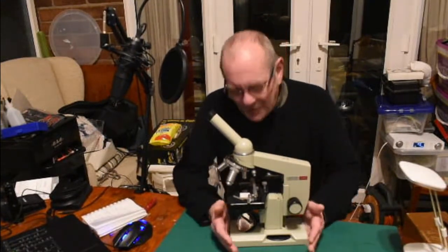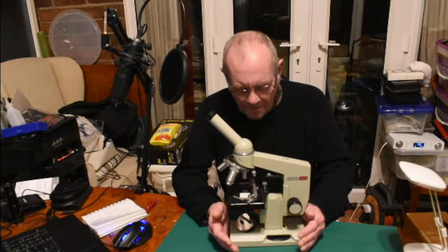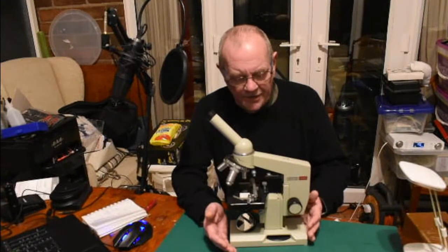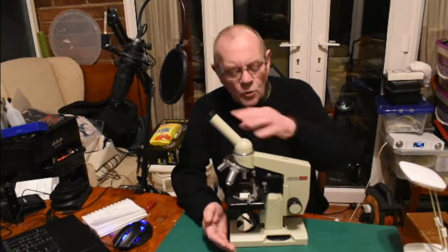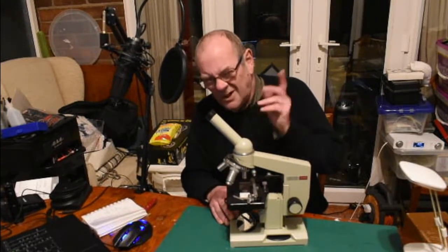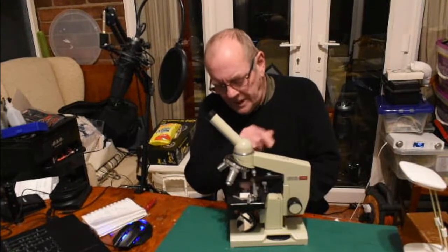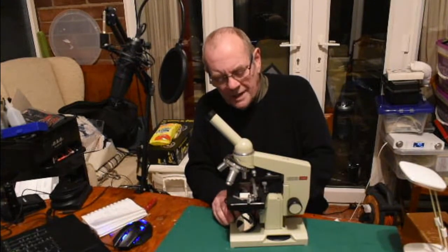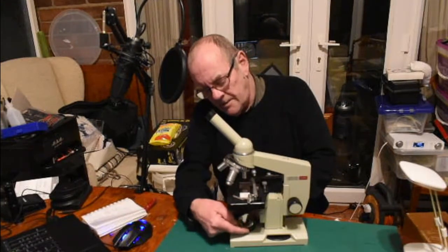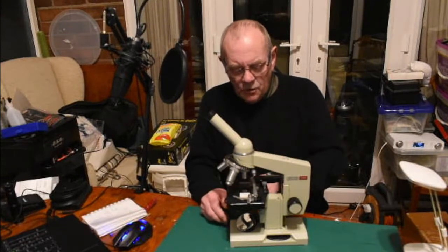The other reason I went for this is you can get them cheap on eBay if you know what you're looking for. The logo — they come in various models, they all look similar. Some have illumination, which is a drawback with this one, but I'll show you a little trick in a minute. I wouldn't be too fussed about finding one with electric illumination — the bulb-based illumination these come with isn't very good. Modern microscopes are all LED now and much better.